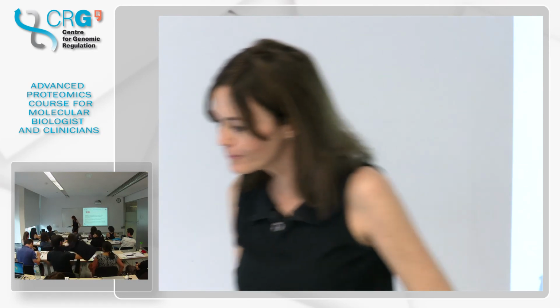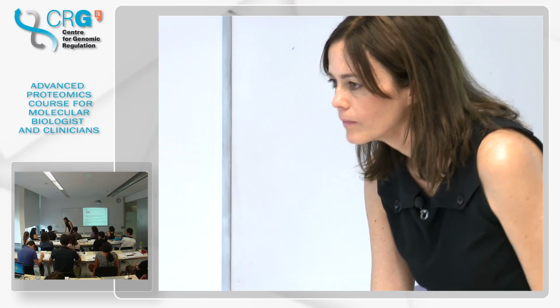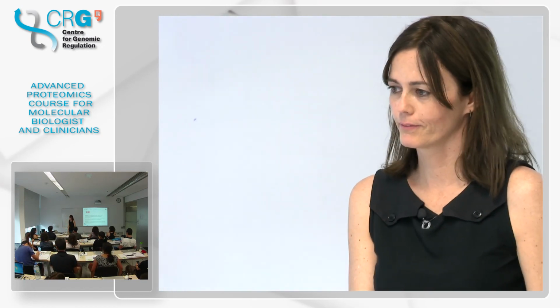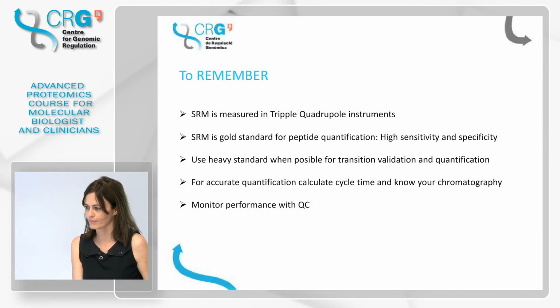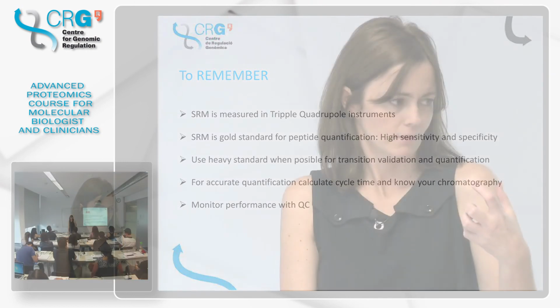When you talk about, in the previous example, you say 25 peptides. Is it 25 peptides or 12 plus the heavy, no? Correct. Double, no? Correct. If you count that you have to monitor the peptide and the heavy, then the numbers get divided by 2.